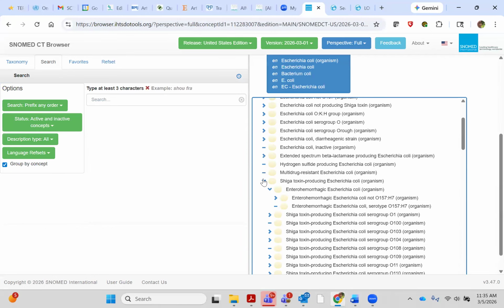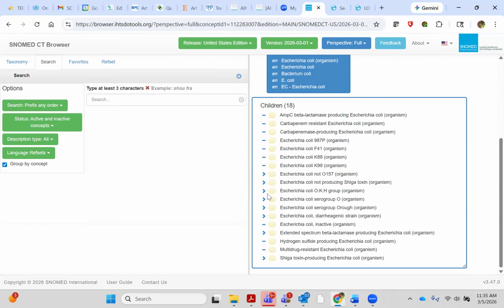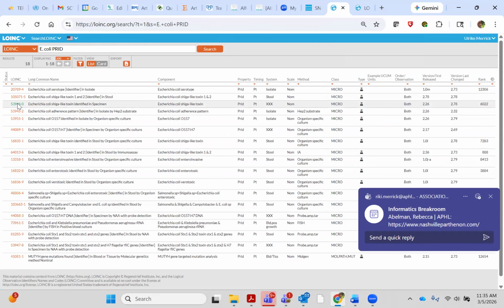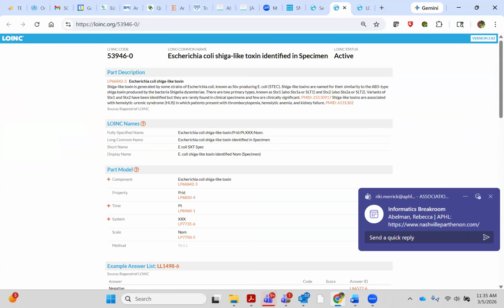Right, we don't use clinical findings in the lab. That's more from a clinician perspective. Is that what you're trying to highlight? Well, no, your result value for the link code would be a finding, if it's an organism specific test. So we don't use the findings hierarchy out of SNOMED in the laboratory. It may be true, it's more the physician interpretation, and they list that on the problem list. So that's why I say it's EHR functionality with SNOMED and the physician's role.